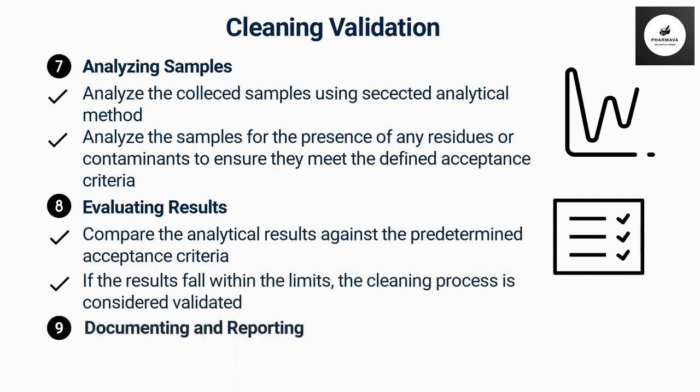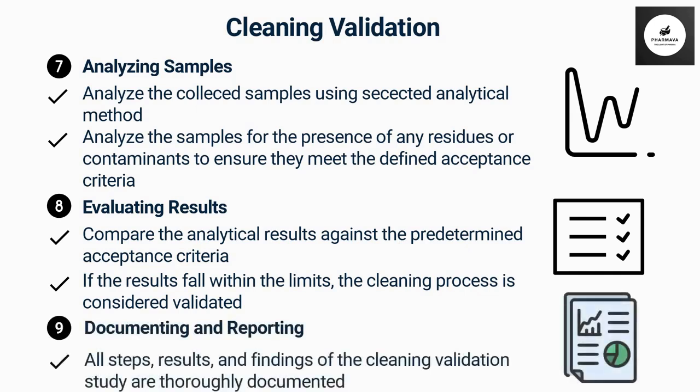Step 9. Documenting and reporting. All steps, results, and findings of the cleaning validation study are thoroughly documented. We prepare a detailed report summarizing the validation process, analytical data, and conclusions.